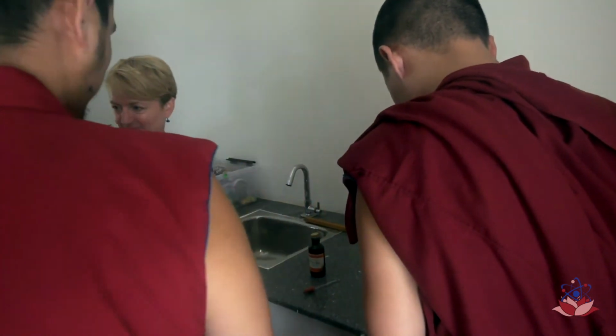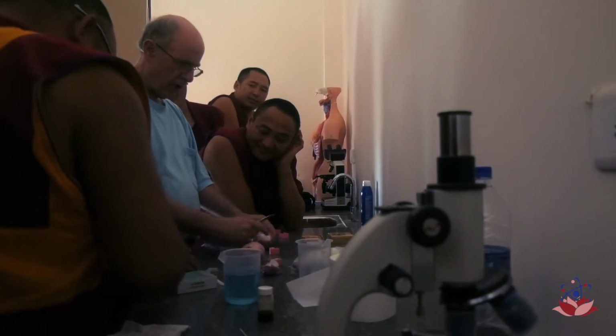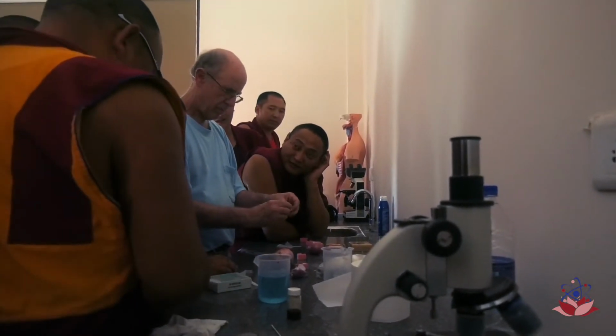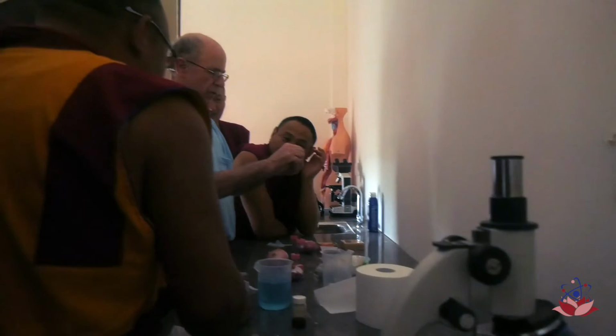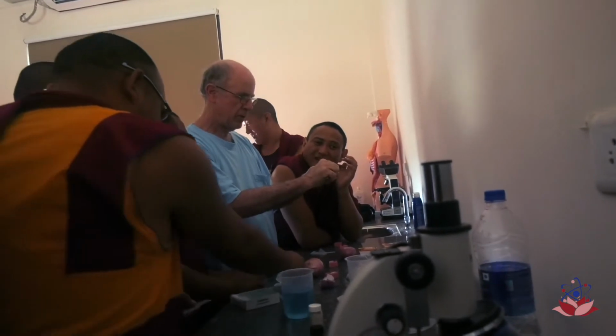Slides. So you don't need the whole quarter, just get a piece of the onion. Peel back the leaf, and then either with your fingernail or with a knife, peel this little membrane.